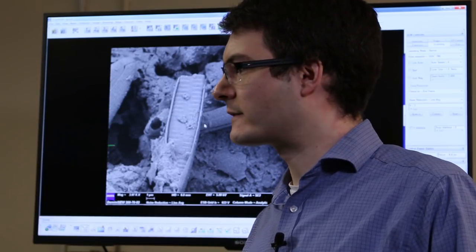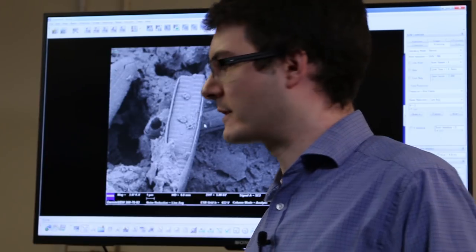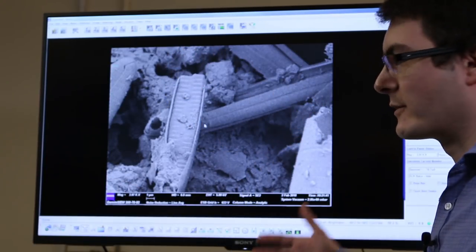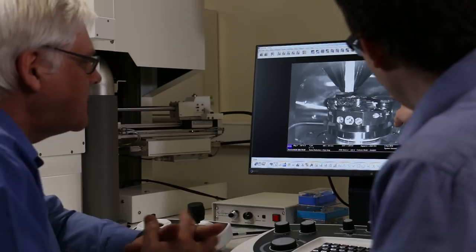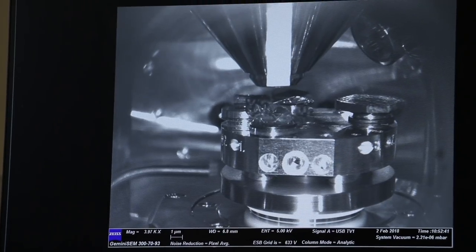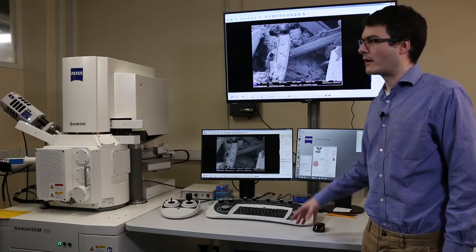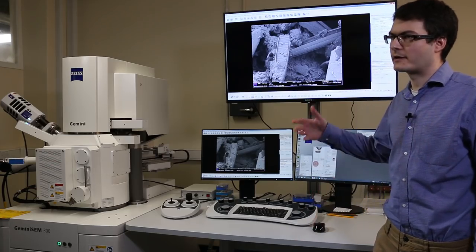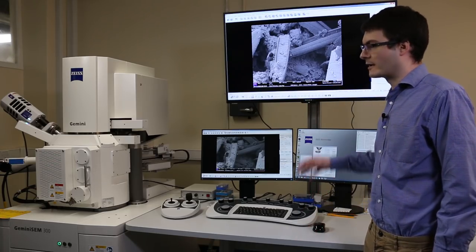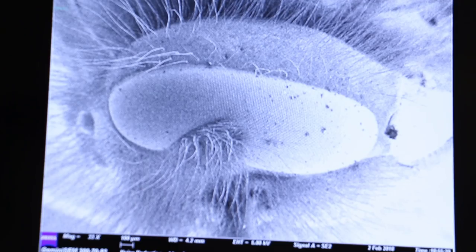One of the great things about this new facility is that because everything is digital these days, we can project the images from these screens up into the lecture theatres — in Meston 1 or Fraser Noble, wherever it is around the university — and I can teach a class of 200 people how to use an electron microscope as if they were down here one to one.